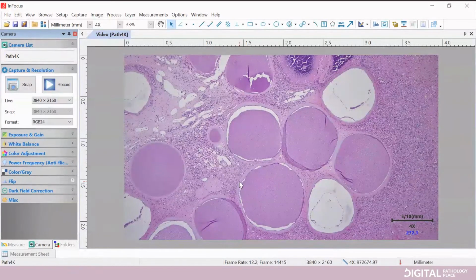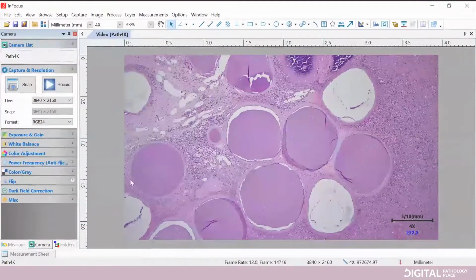I mean, if you have the vignetting, you can still have high resolution and good quality, even if you cut out the image later when you want to use it for anything. But it just makes life simpler, and the simpler, the better for me. Yes, exactly. So with the appropriate C-mount, as you said, you lose the vignetting, but I still have to say you probably still see a very large field of view left to right, especially. So if you look through the eyepieces, you'll probably see about 90 to 95% of that field of view still, which is really nice. Correct.